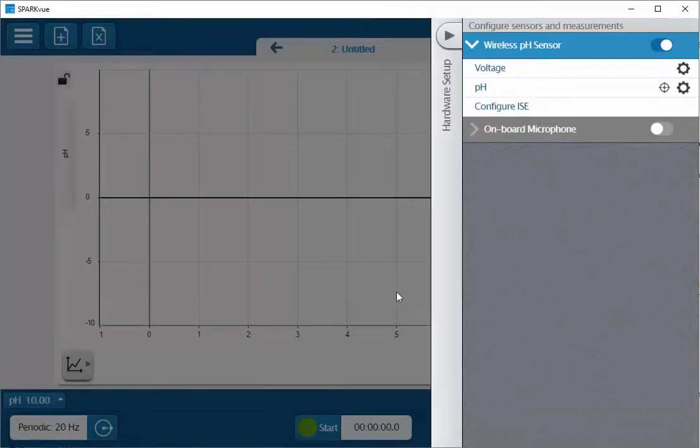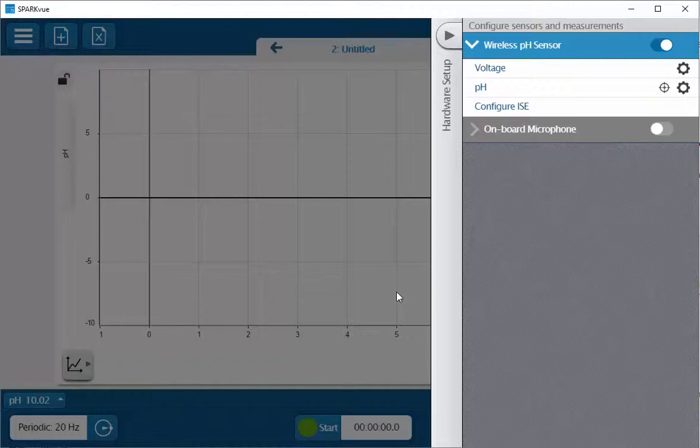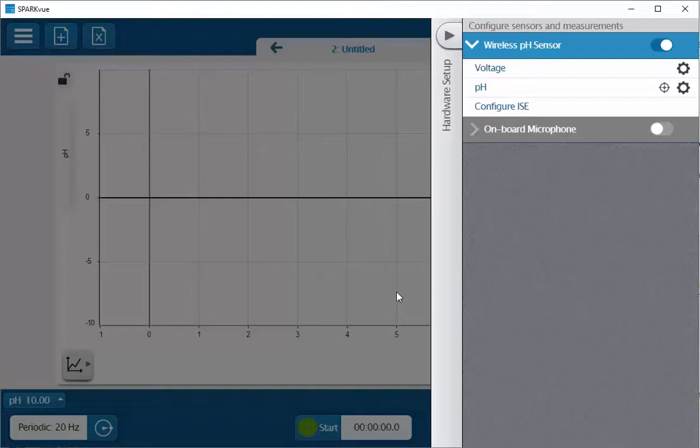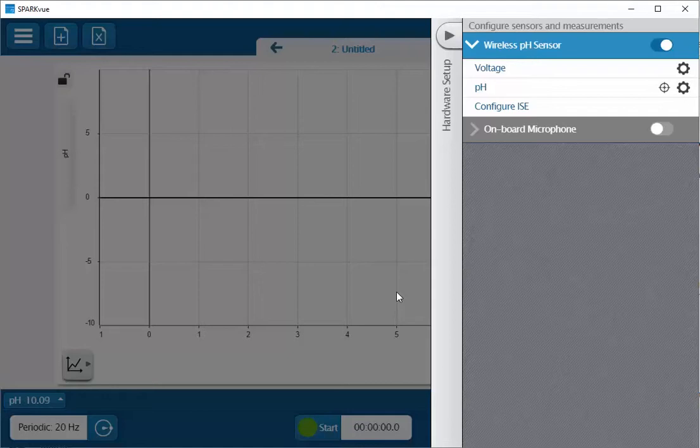My pH electrode is now ready to be used, but before I place that into any solution I'm going to measure, I'm again going to rinse my electrode with deionized water and then I will blot it dry before usage so that I am not diluting the solutions that I will be measuring.